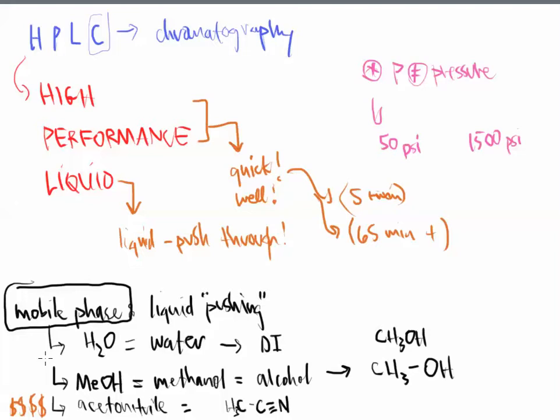And this machine drinks it like crazy. So that's an issue with acetonitrile runs. It's going to be very expensive, and it might take quite a bit for your separation to take place. That's the drawback with using an acetonitrile method. We have acetonitrile in the lab.